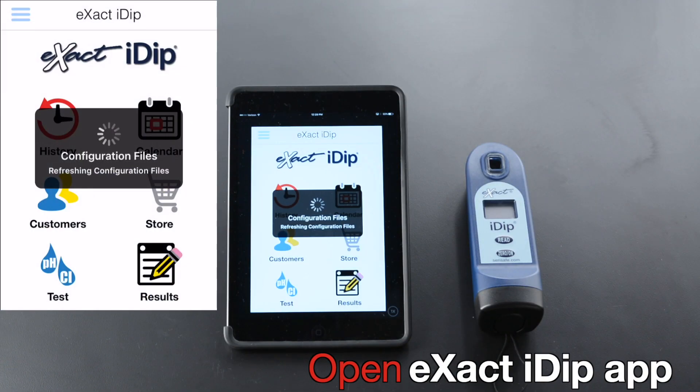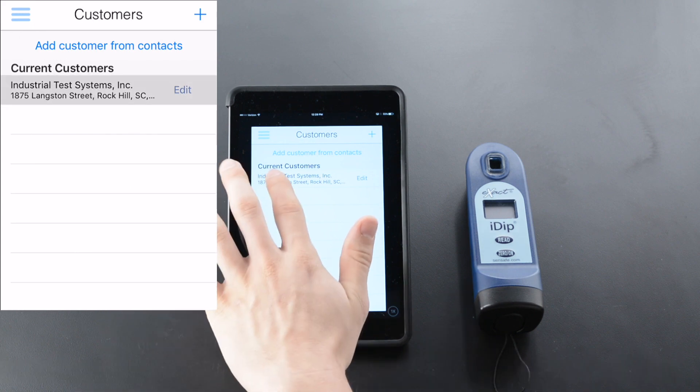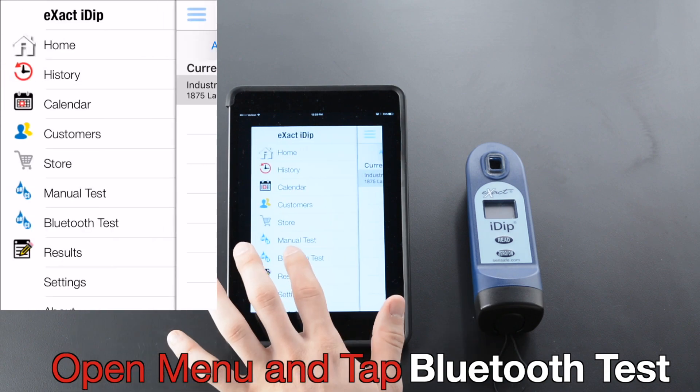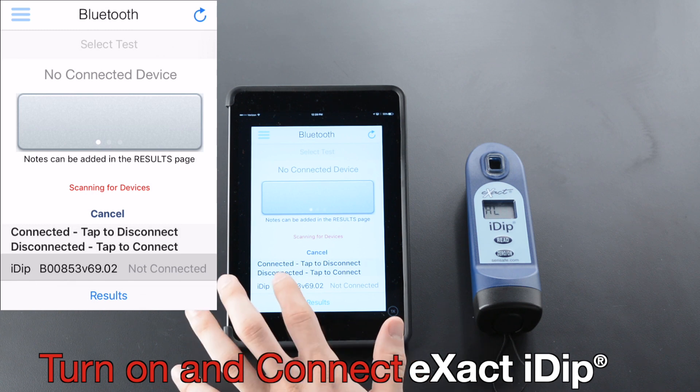Open the XactiDip app. Tap Customers. Select Customer, open Menu, and tap Bluetooth Test. Turn on and connect to XactiDip.